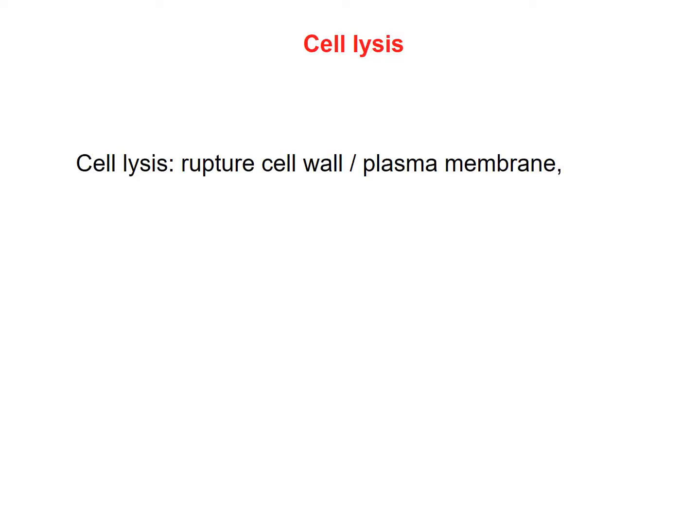Okay, so that leads us into cell lysis. And what I'm going to do is stop now, let you reflect on just kind of the overview of centrifugation. For cell biology, we're usually either isolating proteins or we're isolating organelles. In clinical situations, you may be isolating viruses, bacteria, fungus, parasitic eggs, and materials. So it depends on the clinical versus the basic science, what people are doing. So there's clinical labs and there's basic science research labs, right?